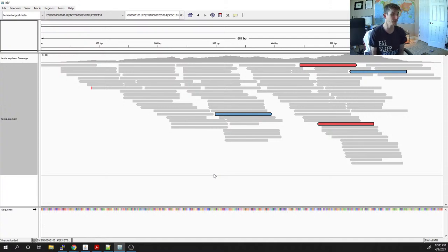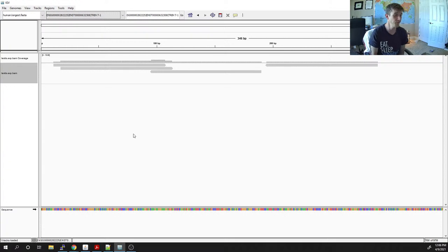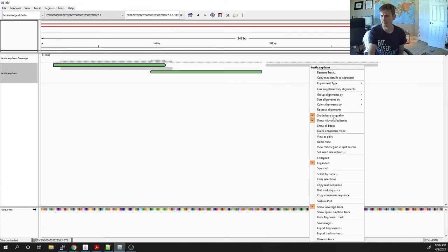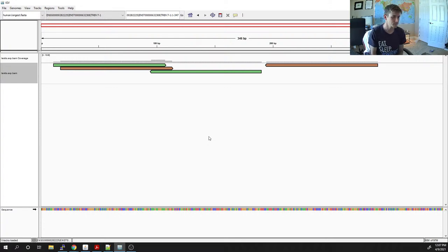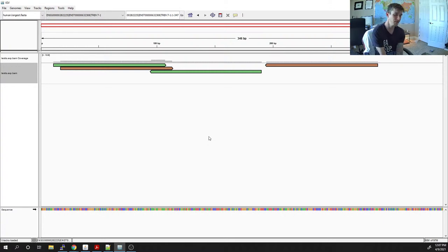This specific gene, CCDC134, has a lot of reads mapping to it. If we look at another gene — TRBV71 — much fewer reads map to that gene. We're only looking at two paired-in reads from this gene. This gene is less expressed than CCDC134 — fewer reads versus dozens of reads. We've effectively estimated gene expression by counting the number of reads that map to each transcript.